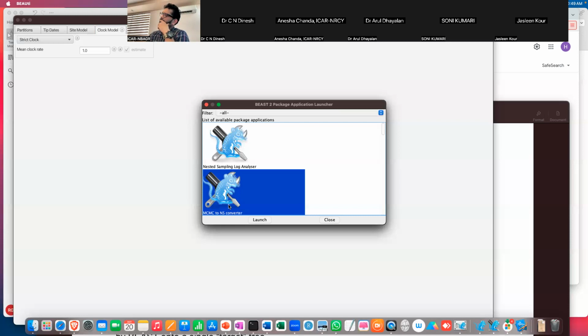When I put the alignment in, nothing is selected for alignment, so select all, and then it will initialize and show something. For the translated sequence, please select the correct genetic code or the coding frame. There's something wrong with your codons then. Sir, I just copied that PPRD file. We'll do that during the break. We'll finish off BEAST and we'll do that, right?